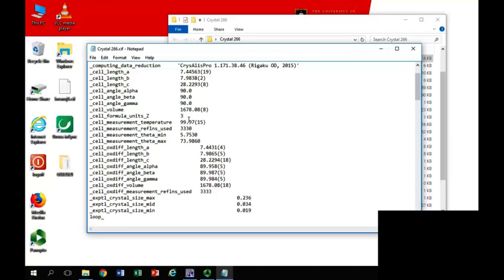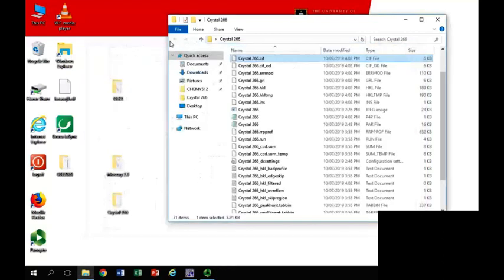When you get your files, copy them and store them somewhere safe, perhaps under a different name, because as soon as you start doing things, it overwrites everything. If you need to go back and do something again, you will need your original files. If you've overwritten them, you won't have them. So save them, put them in a folder, call them something else, or relabel the folder and label them 1, 2, whatever, and you can start all over again.